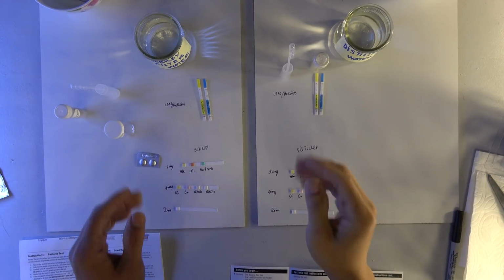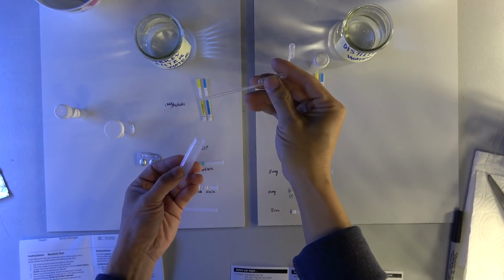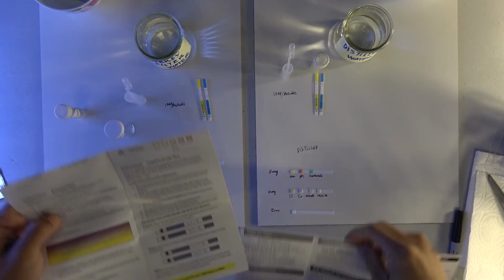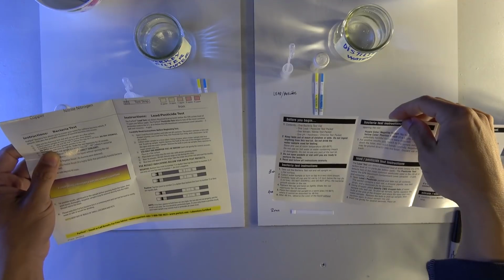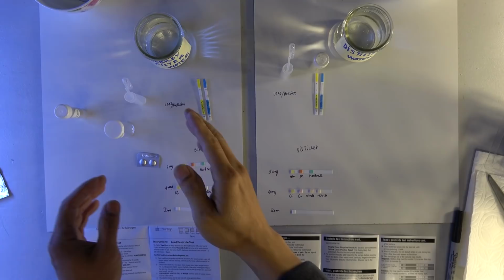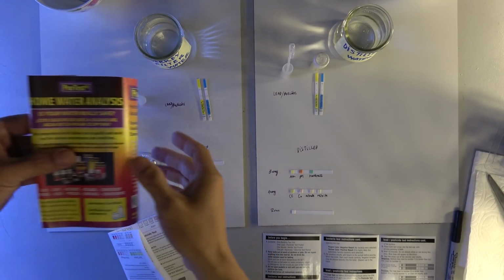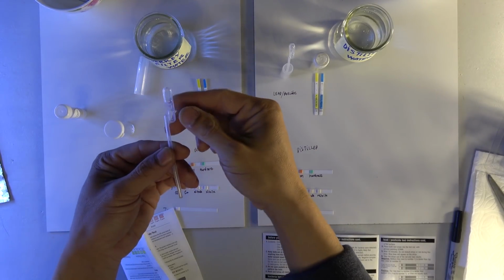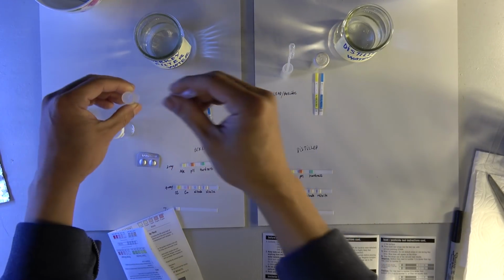So the way you do this is you take the provided vial and the dropper. The instructions on each of the test kits are almost the same, except for the amount of water. On the Purtest brand, you only need 1 dropper full. So you just suck up 1 of these into the vial of water.